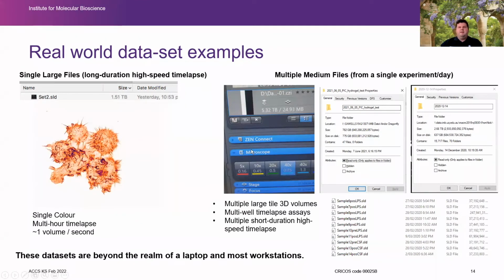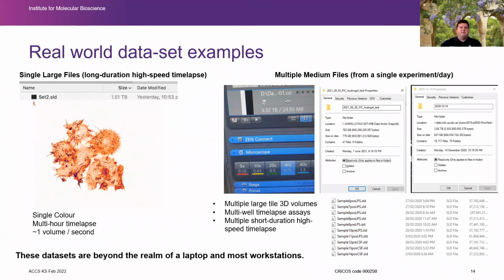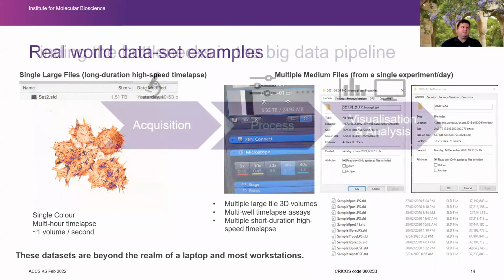So we can have tiled imaging of high resolution pathology slides, and we can have varying imaging methods where people take multiple time lapses in high throughput well plates, or people just taking highly processed lattice volumes. But the general consensus we have is that the data sets they produce are just beyond the realm of their laptop or most workstation computers that we were using.